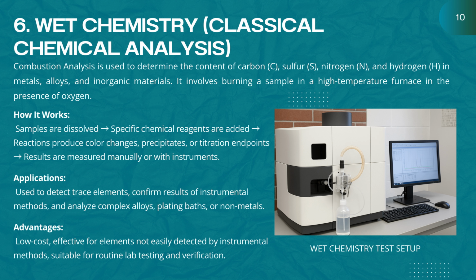This technique is great for detecting trace elements and is often used to verify or cross-check results from more advanced instruments. It's a cost-effective method, especially for elements that are tricky to detect with machines. So it's still widely used in labs for routine checks and complex analysis.